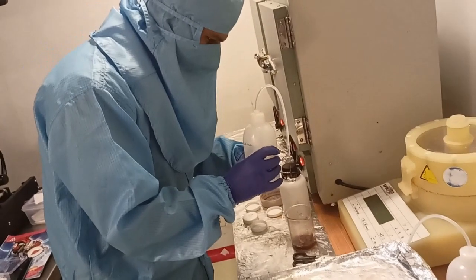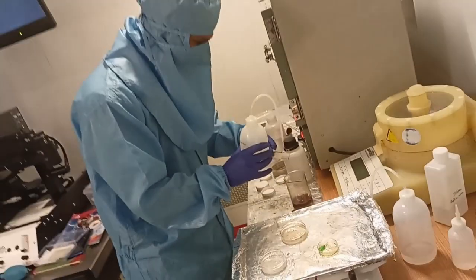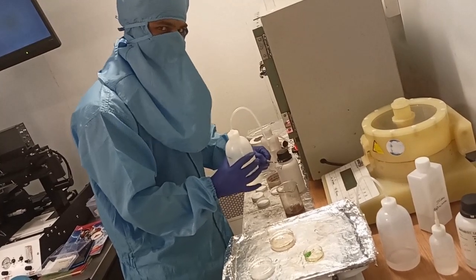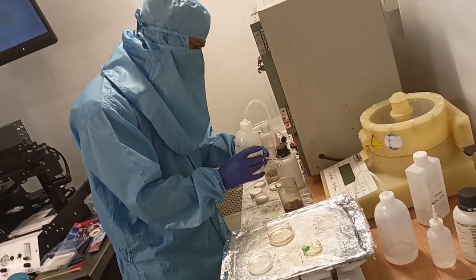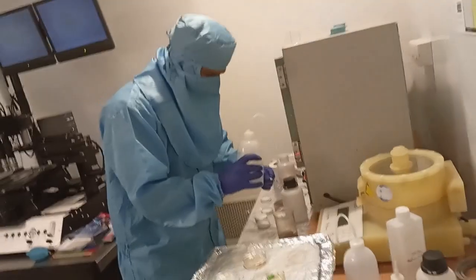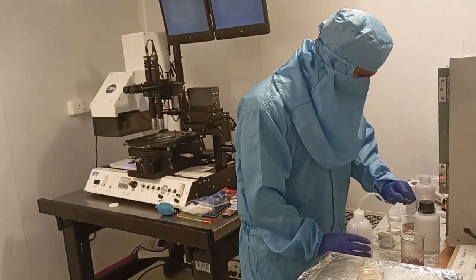So you are rinsing with DI water? Yes, I am washing off with DI water. It was shaken within the developer. Just like washing clothes: we wash clothes in detergent, and after that we wash with water. Here the detergent is the KOH solution, a basic solution, and we use DI water to remove the salt which has been formed within the developer.